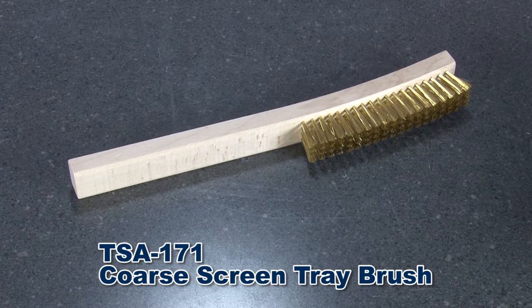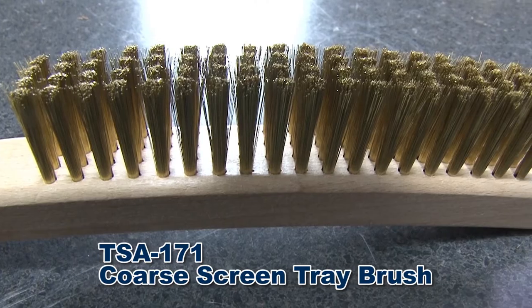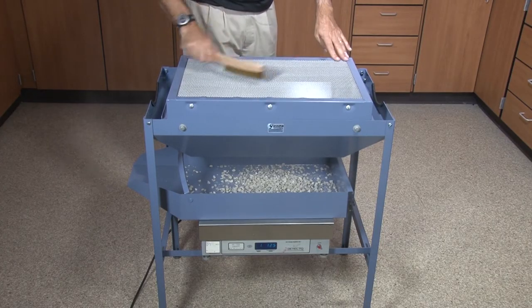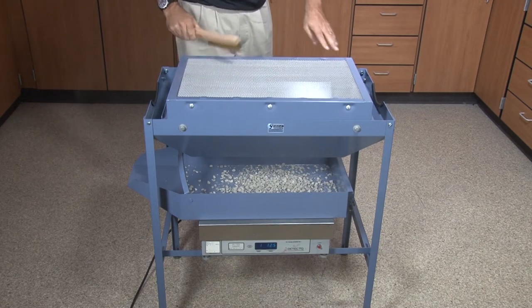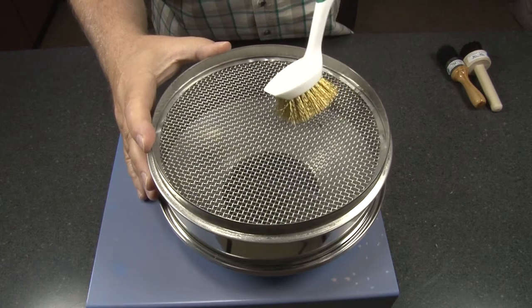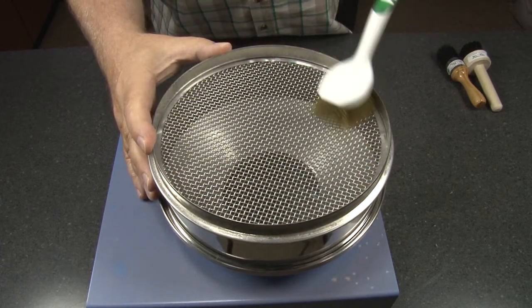The Gilson TSA 171 coarse screen tray brush has brass wire bristles to effectively remove trapped particles from screen trays with coarse openings. Gilson's TSA 172 coarse sieve cleaning brush has an eight and a half inch curved handle and works well with number 30 and coarser wire cloth in round test sieves.